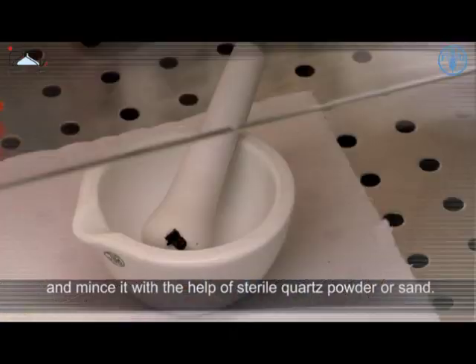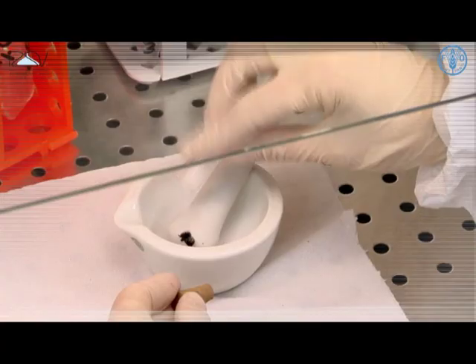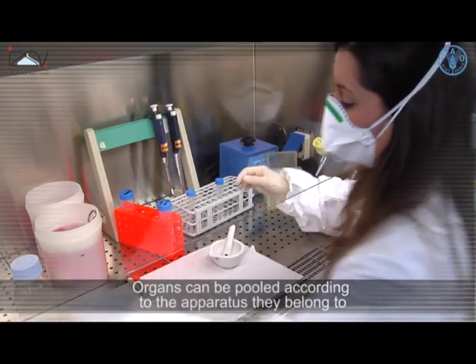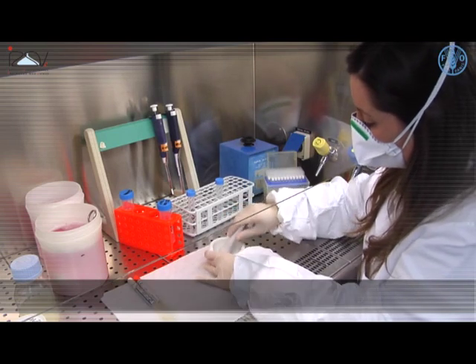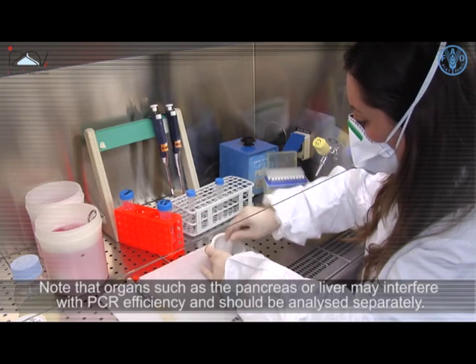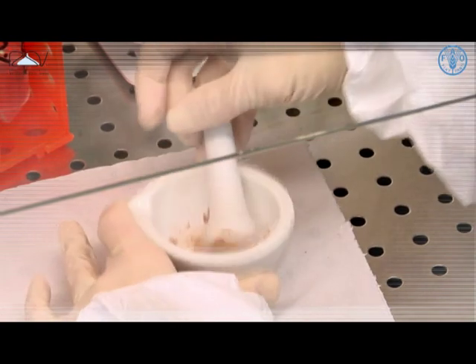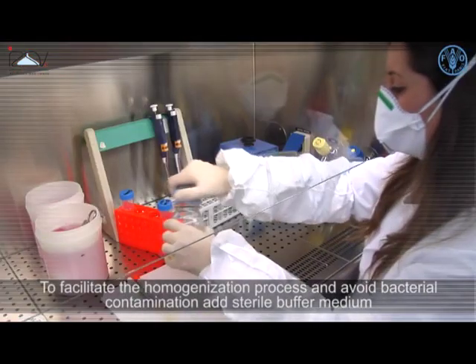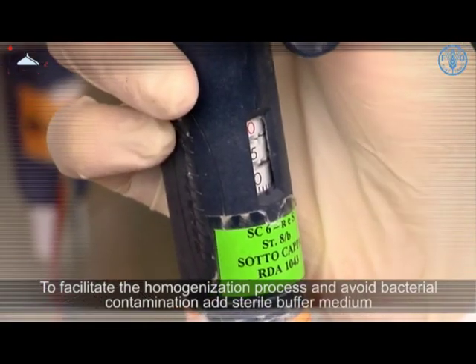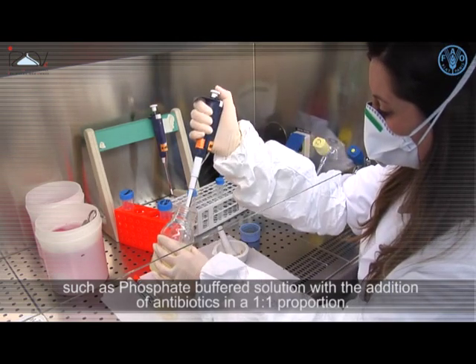Mince the tissue with the help of sterile quartz powder or sand. Organs can be pooled according to the apparatus they belong to. Note that organs such as the pancreas or liver may interfere with PCR efficiency and should be analyzed separately. To facilitate homogenization and avoid bacterial contamination, add sterile phosphate buffered solution with antibiotics in a one-to-one proportion.